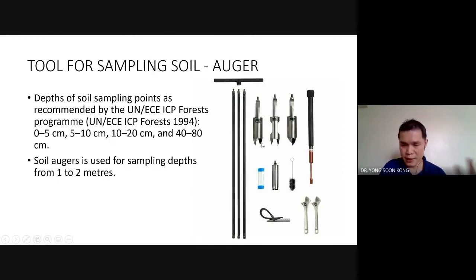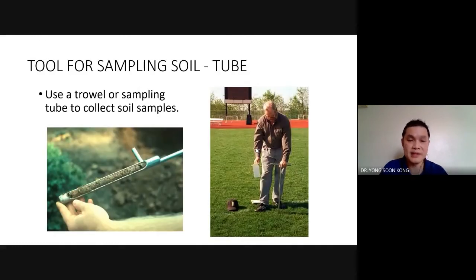Now with this tip, when you twist it, it encompasses some drilling action. So they drill slowly, and the circular movement of this tip slowly picks the soil and moves it upwards, and essentially it minimizes the invasion or disturbance on the soil structure. Cannot say there's no disturbance. It is there, but very minimal. This one even less, because why? You see the diameter very small.